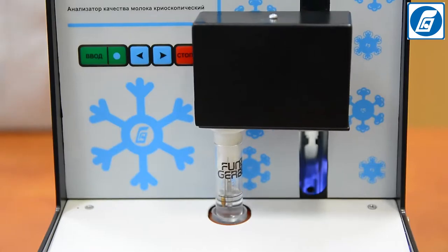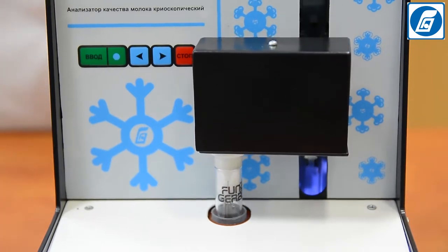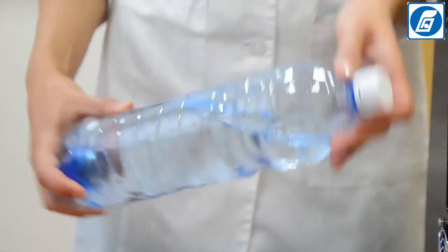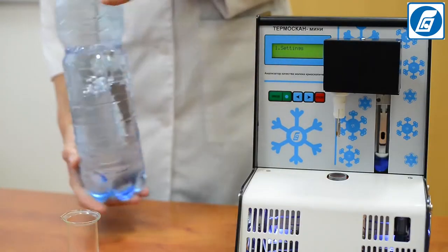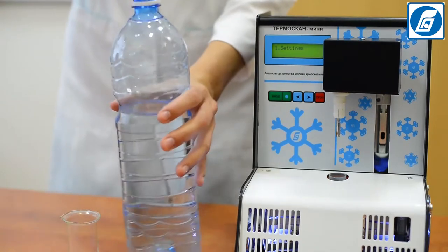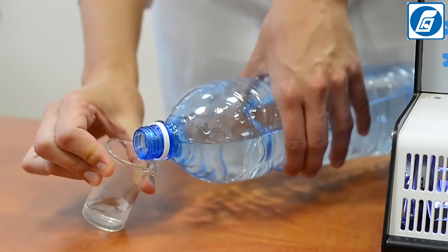It is necessary to prepare 1000 cubic centimeters of a standard solution with a freezing point of minus 0.512 degrees Celsius. Store the solution at 5 degrees in well-capped plastic bottles with a capacity of no more than 250 cubic centimeters. Before using the standard solution, turn and slowly rotate the bottle several times, carefully mixing its contents. The standard solution cannot be shaken, as this causes air bubbles.